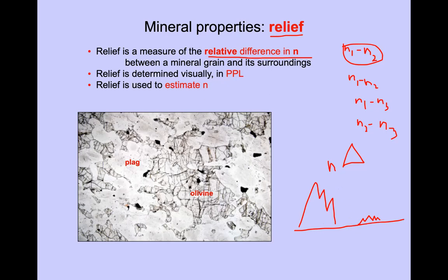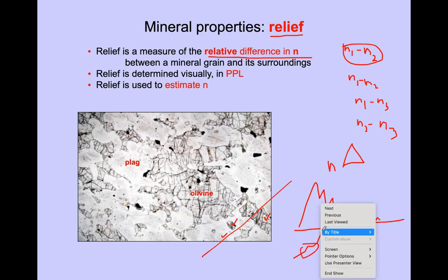For minerals also you have a similar property which we call relief. For example, you have one mineral here, another mineral here, and another mineral here. It's like seeing a kind of cross section: you see a very planar shape here, a little bit higher relief in the second mineral, and the other again has low relief, and the other one will have another kind of relief. So you are seeing some high relief areas.